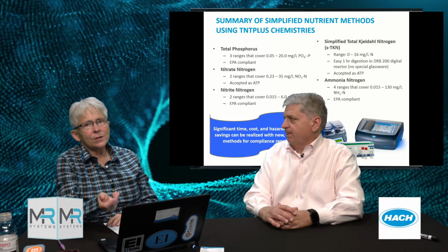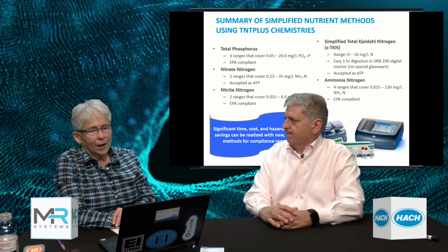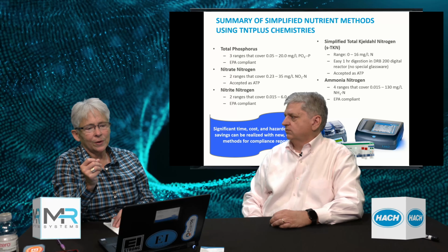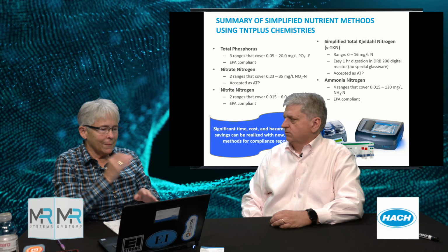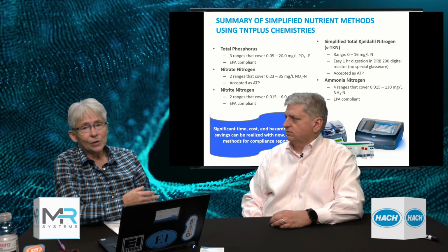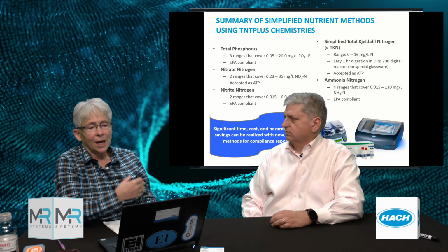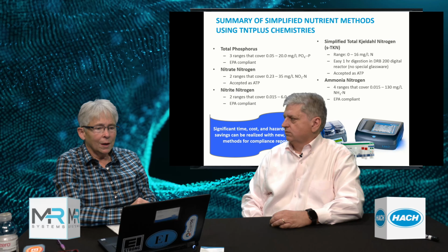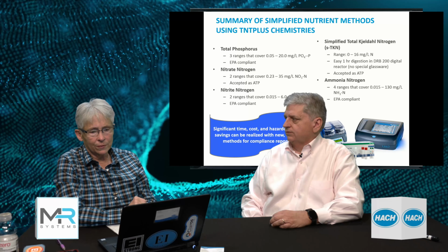Yeah, it is. There are many plants here in Georgia as well as the Carolinas, where mostly I work, that have switched to ammonia-based aeration. Because you're right, it is about the actual value. It's not the DO, it's not the pH. Those are important, you're setting the environment. But measure what you're actually trying to reduce. So look at ammonia, look at nitrate, nitrite, look at your phosphorus, and have those values coming in through powerful SCADA systems, but verify. You're using those lab tests to verify, verify, verify, verify.